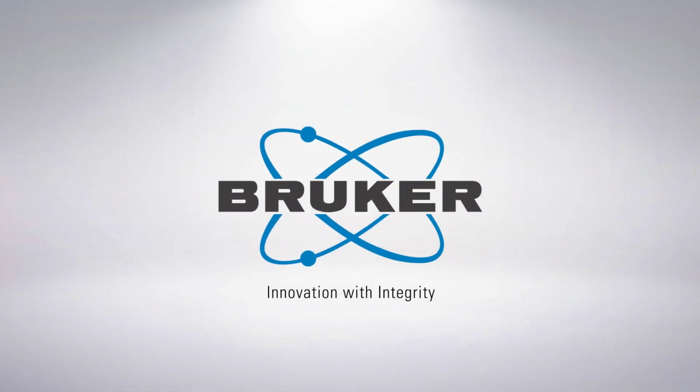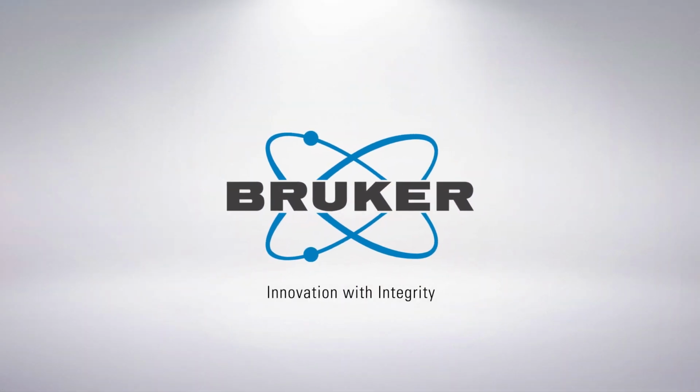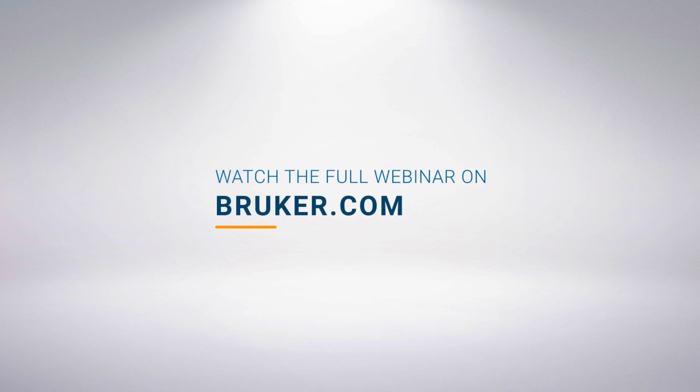And I want to illustrate that again with the centrosome labeling. So, like a lot of people, the reference fluorochrome is Alexa Fluor 647 to obtain this good blinking.